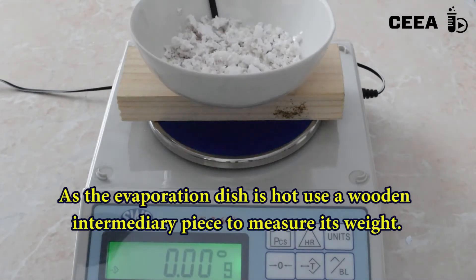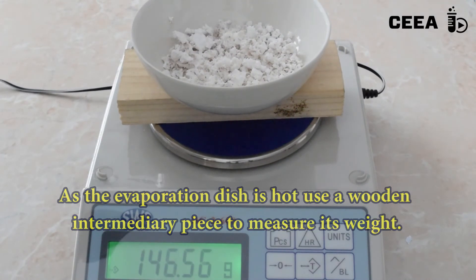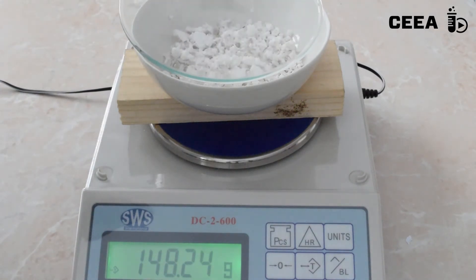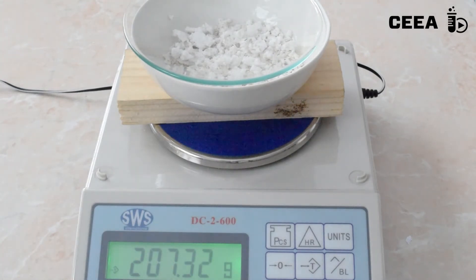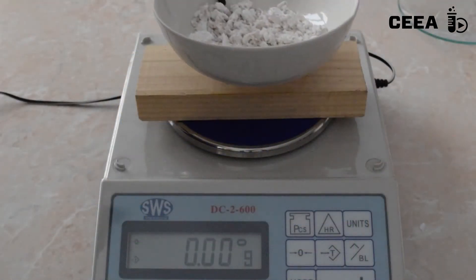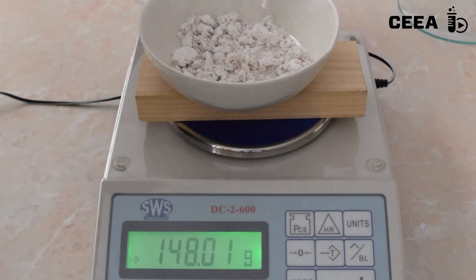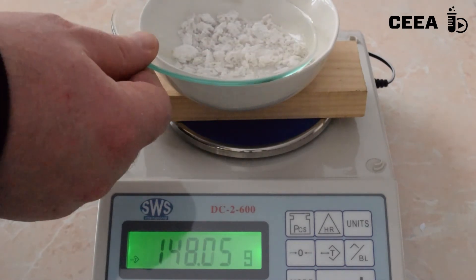Measure the covered dish with its content from time to time until the weight is constant. When the mass is constant, subtract the mass of the dry salt from the hydrated one. The difference is the mass of water.